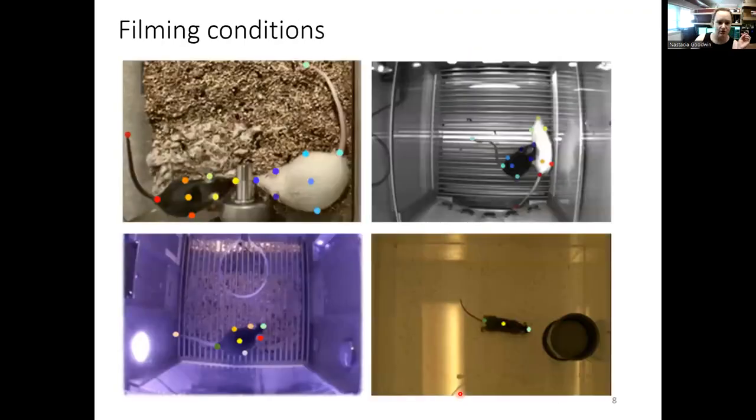So I'm going to start going into kind of the questions that I get when people start using DeepLabCut. And SimBA is compatible with kind of any of the pose estimation stuff. So again, like SLEAP, DeepLabCut, DeepPoseKit, Bento. There's several other ones. I'm going to talk about DeepLabCut just because it's what I started using and it works well, so I'm probably not going to change.